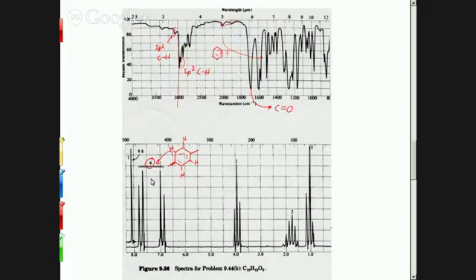And I think that's what you see in your spectra from today, right? If you look at that spectrum, in that aromatic region, in that region from 6 to 8, where we see those rings, you just see a bunch of junk. And so the word for that is a multiplet. We don't really know if it's a doublet or a triplet or a quartet. We can't really analyze that splitting. It's just messy. It's all on top of each other. So we just say that's the aromatic region. We can't really get more detail than that, and we can't really talk about how many neighbors it has because it's just too messy.